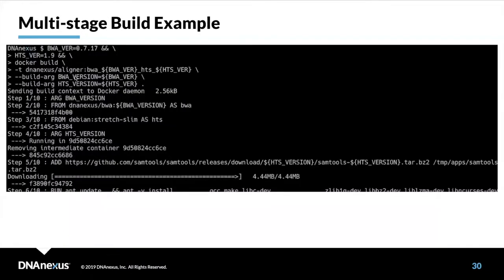We can build our multi-stage builds the exact same way we build a regular Docker image. Remember that I've parameterized the versions of BWA and SAMtools. So I pass those in as variables, give it a tag — I like to tag things using the name and version of the tool so tags are long but very descriptive. I pass in variable values using the --build-arg option, and the build context directory is just the current directory. The last step is copying those files over from the source images, generating a final image.